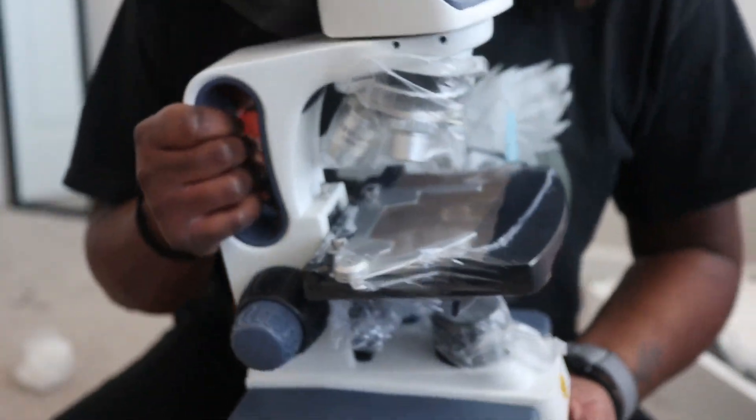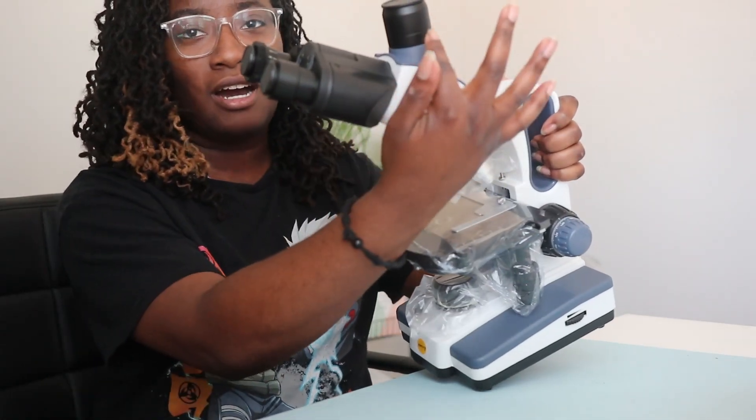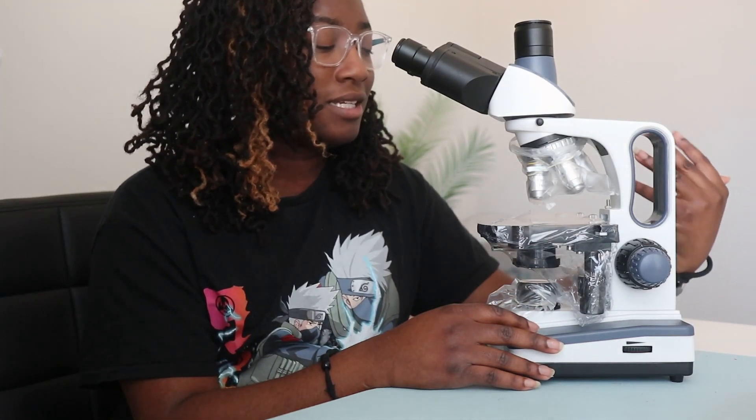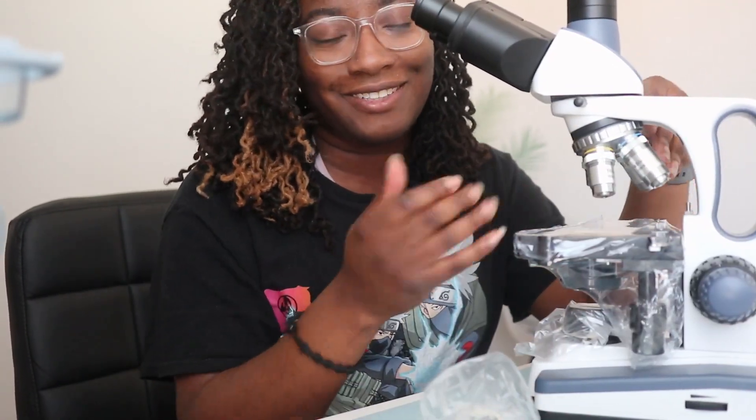It's actually really cute and really nice — let's take it to my desk. It's a trinocular compound microscope, mainly geared towards hobbyists and laboratory applications. The manufacturer recommends it for professionals and students who want to study samples like bacteria, plants, soil, or water. I take it that this scope has all the same features as a clinical-grade microscope, like what I use at work as a medical laboratory scientist, except this one is a lot more affordable. We have the objectives already loaded onto the microscope.